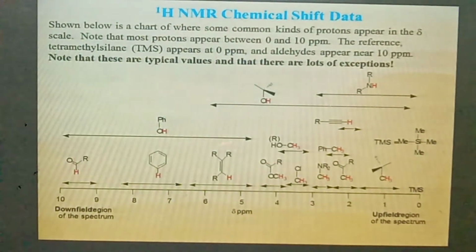This table shows the different absorption positions of protons present in different types of compounds.